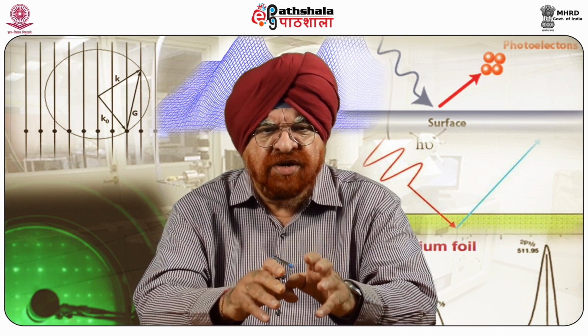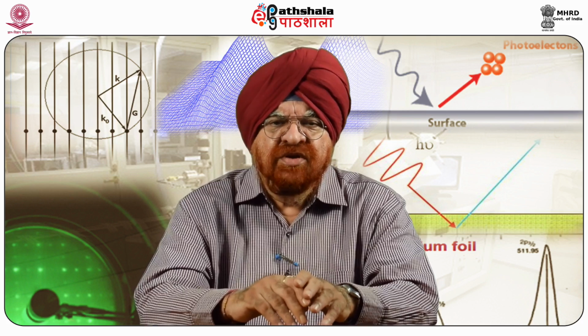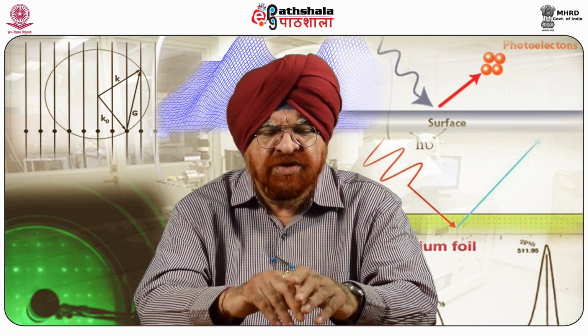Measurement is non-destructive to the crystal lattice or structure. This is a very big advantage when we compare it with other techniques. For example, if you use ESCA, which we call XPS, there the sample is destroyed. So in this technique, the sample is not destroyed, and we can carry out the measurements once again. Therefore, this is a non-destructive technique to the crystal lattice or structure.